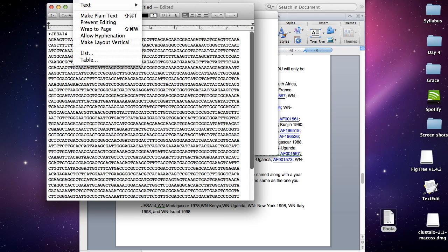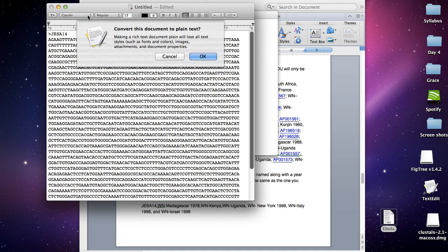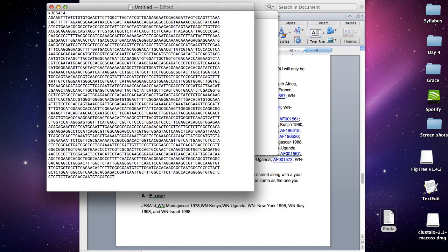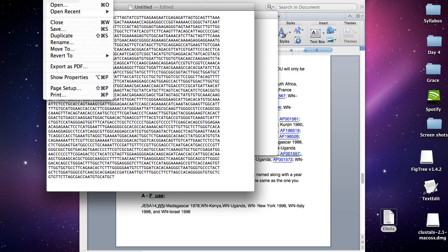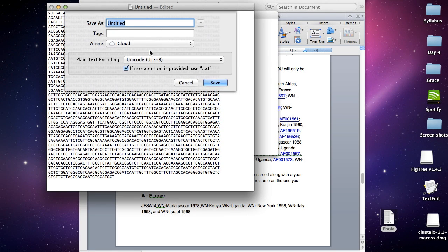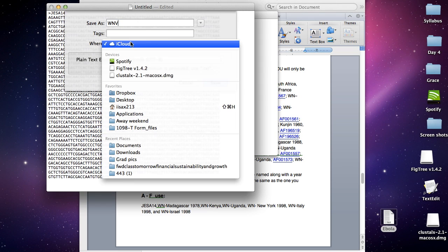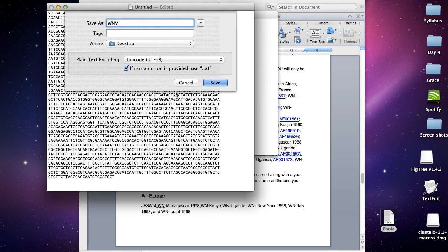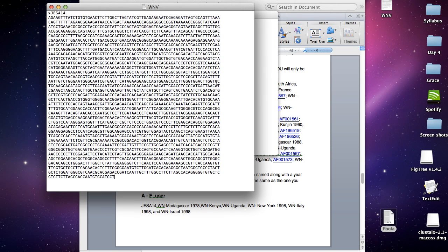Go to format, make plain text, and that'll change it. Then do file save, and I'm going to save this as West Nile virus on my desktop, then hit save. Remember, we need the files to be in .txt format. If you're using Notepad, you don't have to do any of these extra steps. Usually it automatically saves it in .txt for you.